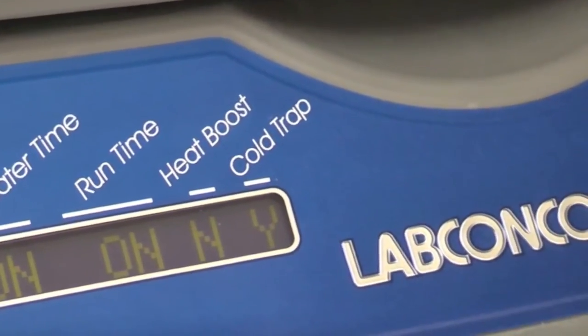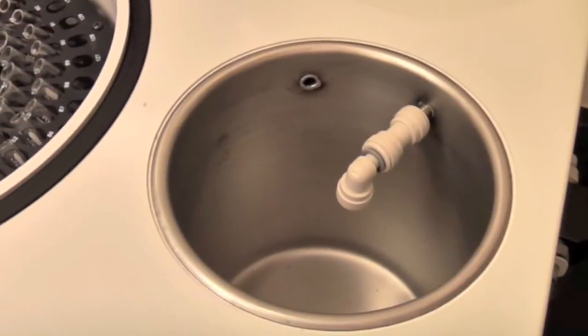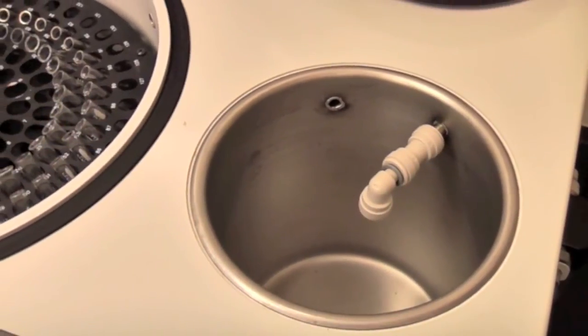As the sample evaporates, a built-in 4-liter cold trap traps solvent vapors for reuse or proper disposal. For acidic samples, an acid-resistant model is available.